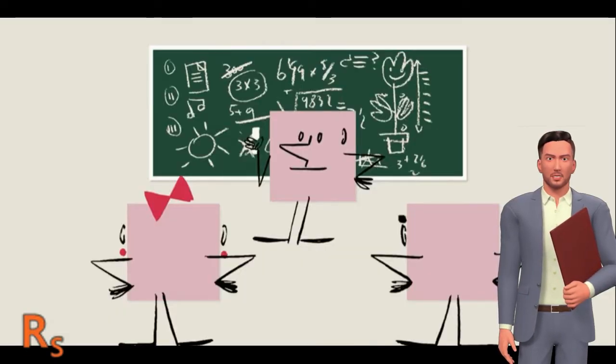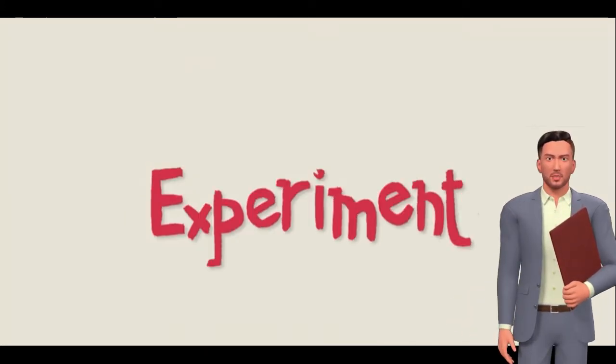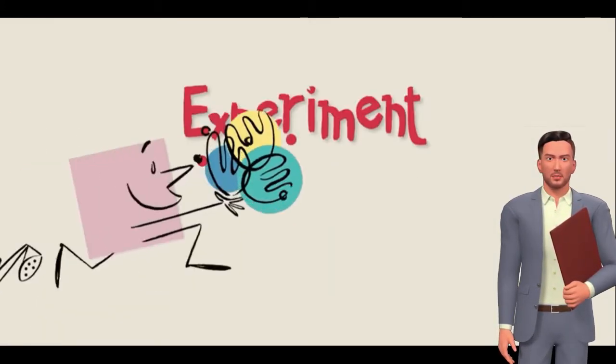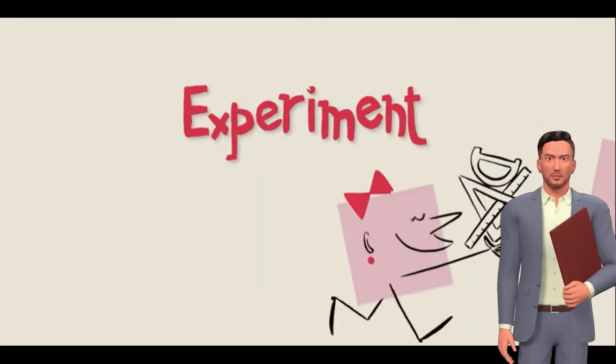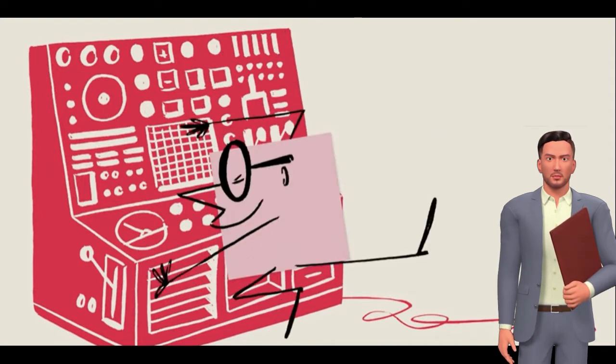Week 3. Data Validation, Kramers-Kronig Transforms, KKT, Linearity, Causality, Stability, Impedance versus Admittance, Applications, and Limitations, Alternatives, Measurement Model Analysis and Linear KKT.